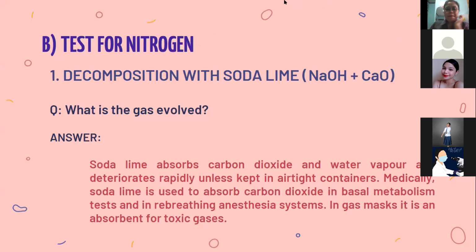Yes. Okay. B. Test for nitrogen. Number 1. Decomposition with soda lime. Sodium hydroxide plus calcium oxide. Question: What is the gas evolved?